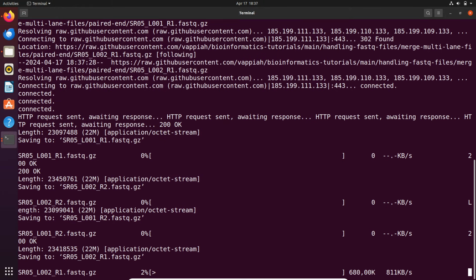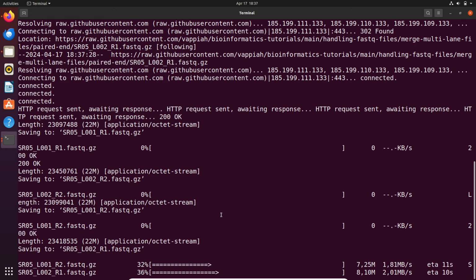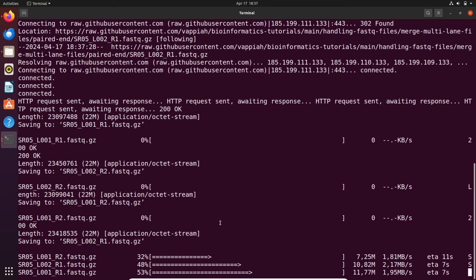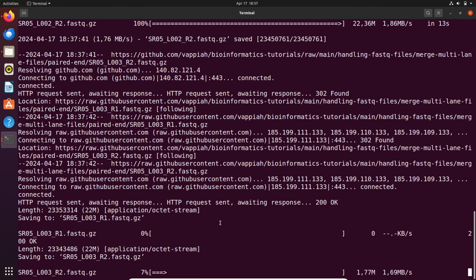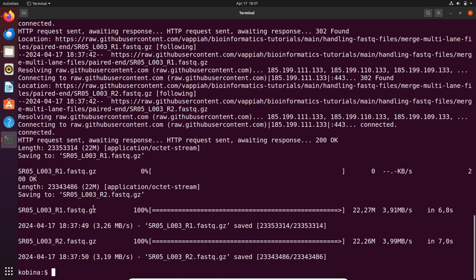Okay, so everything is being done. You can see the progress also follow. So we can just wait whilst everything gets done for us. These are small files, and so internet is not going to be an issue for you, hopefully. Okay, all the files have been downloaded.